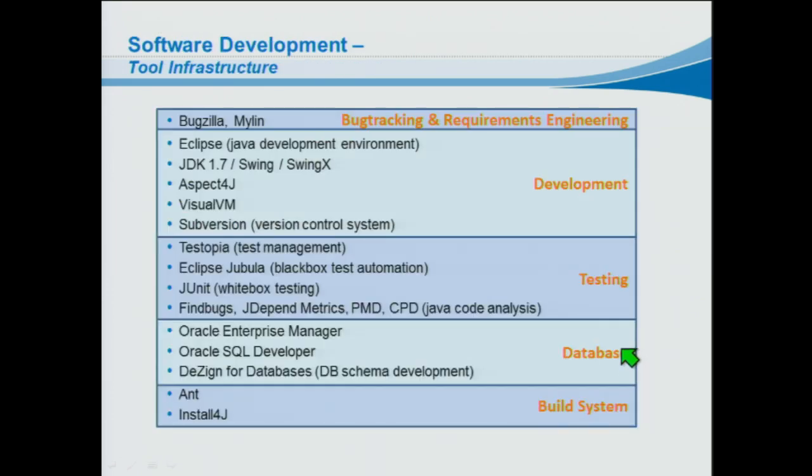Well, some of you are also software developers. I want to give you two slides and insight into how we work at Biocrates. The complete application is designed in Java, and we are using Eclipse. What really worked well for requirements engineering was Bugzilla in combination with Mylyn and Subversion as the version control system.